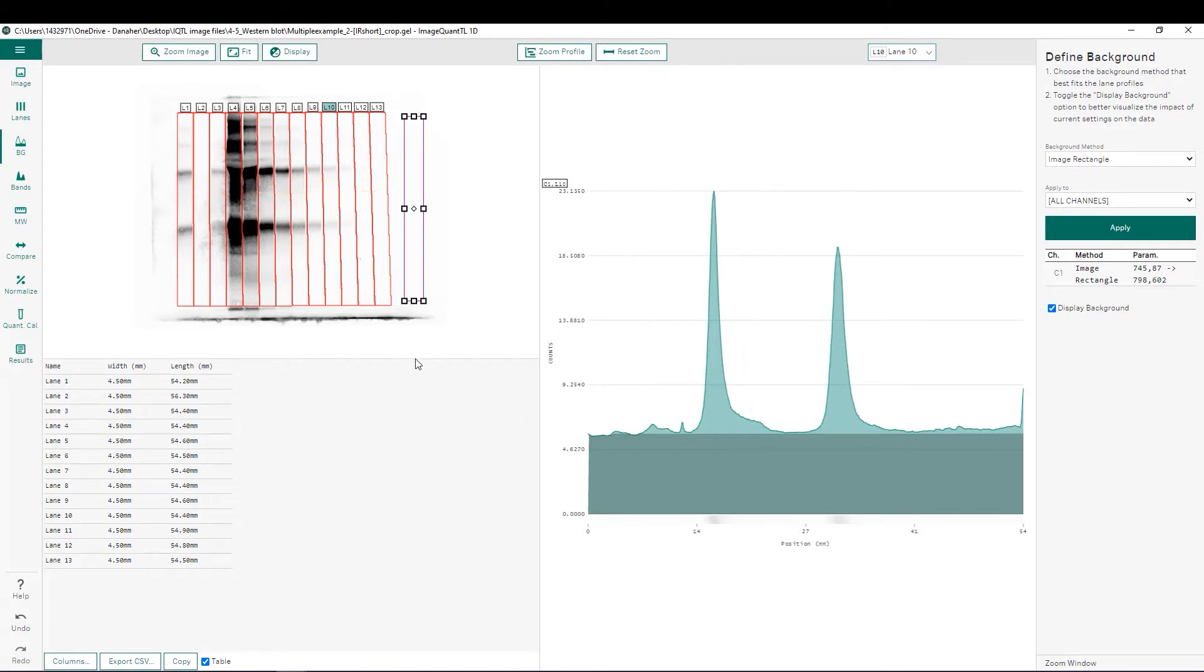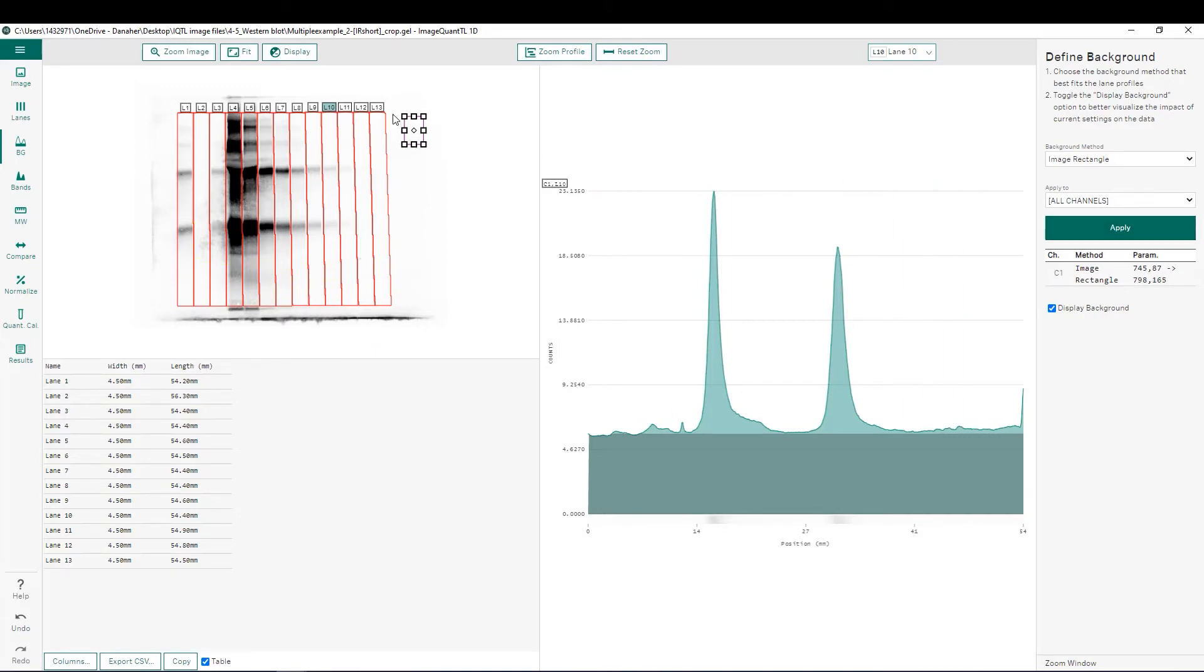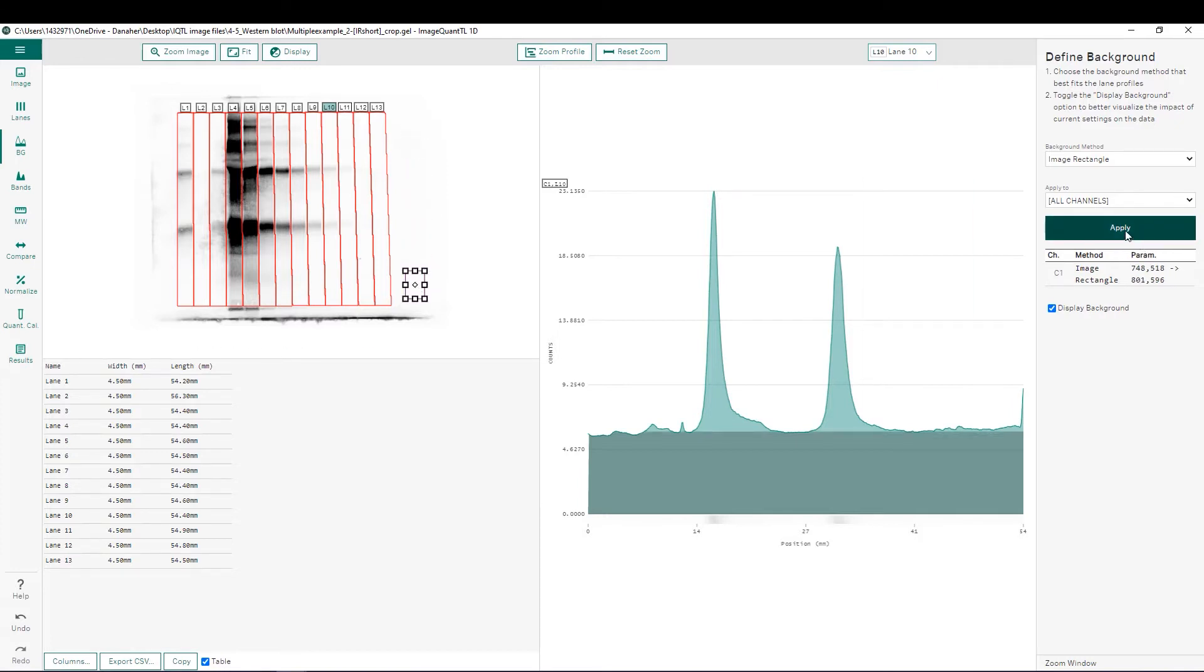One of the downsides to image rectangle is that it's highly dependent on both the position and the size of this box that's being created. So for example, if we have a smaller box at the top of our image, we're going to get a different background taken away than if we have that same size box at the bottom of our image. This can have an effect on relative pixel intensities if you have multiple people analyzing the exact same image.